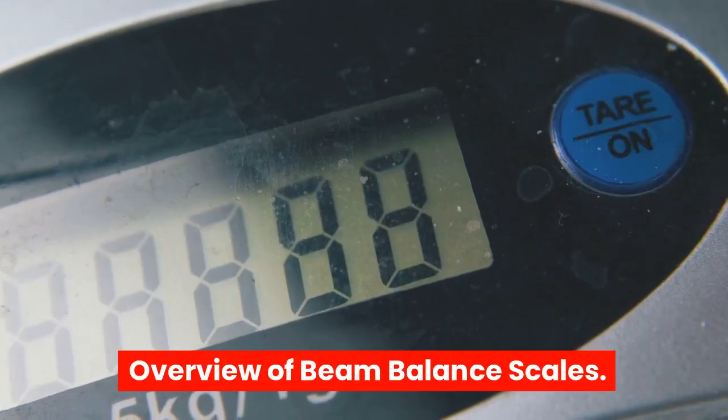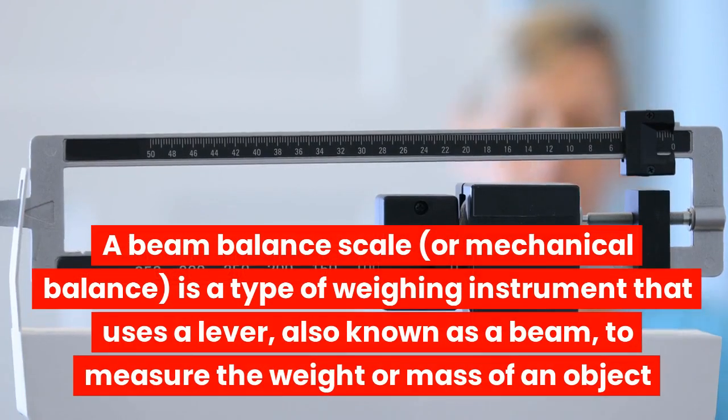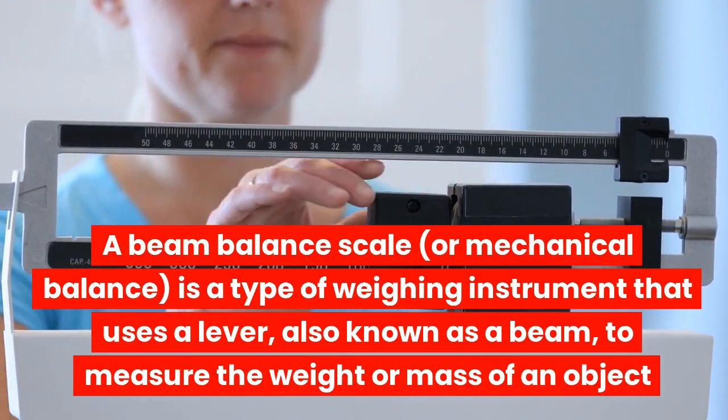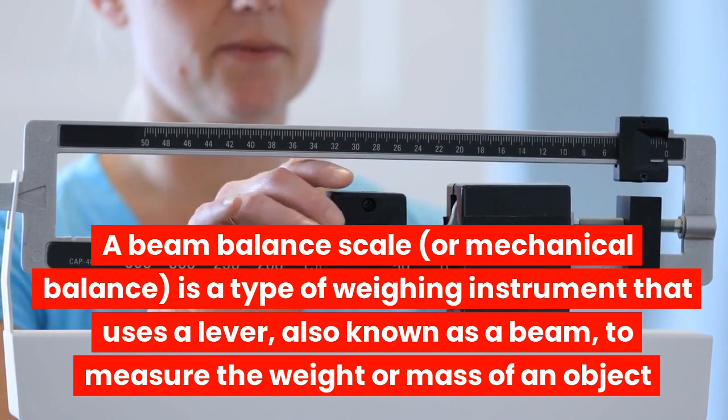Overview of beam balance scales. A beam balance scale, or mechanical balance, is a type of weighing instrument that uses a lever, also known as a beam, to measure the weight or mass of an object.